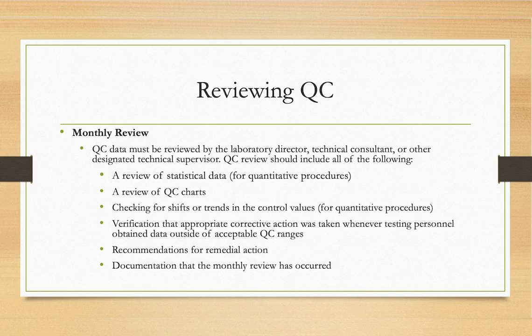A review of quality control charts, checking for shifts or trends in the control values, that is, for quantitative procedures. Verification that appropriate corrective action was taken whenever testing personnel obtained data outside of acceptable quality control ranges. Recommendations for remedial action and documentation that the monthly review has occurred.